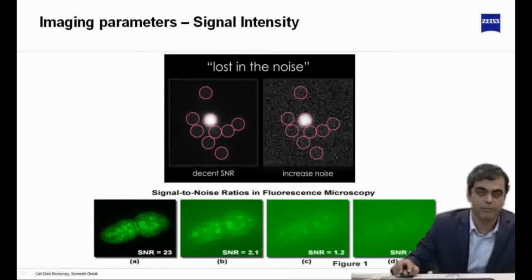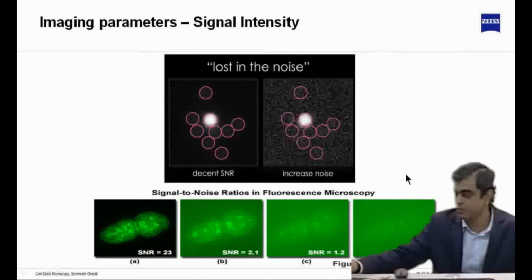Which is also evident from the image below, where you see an SNR of 23, and gradually, as the SNR falls, we see the background noise has increased so much that we are losing the actual signal.